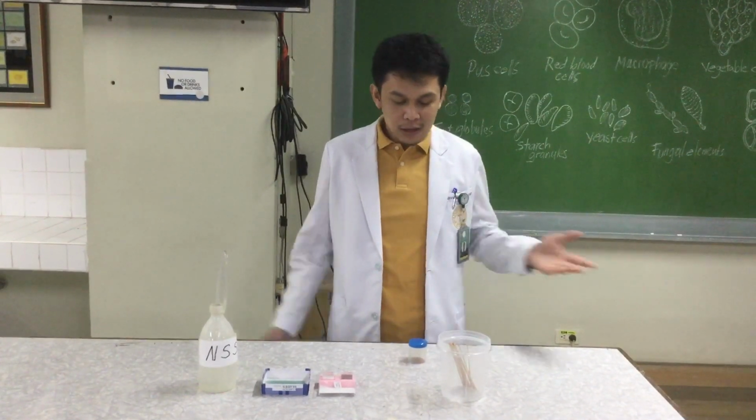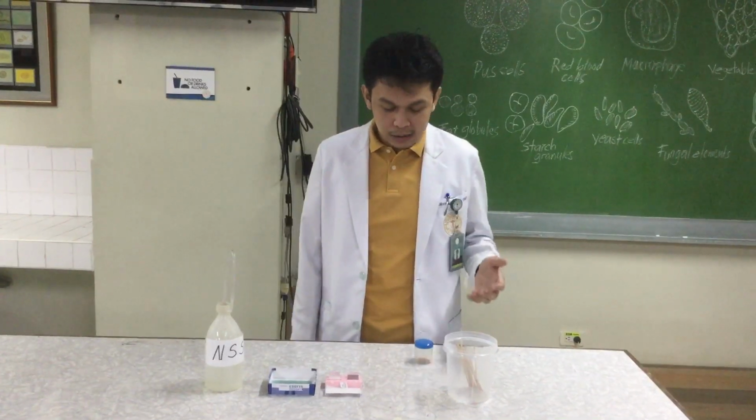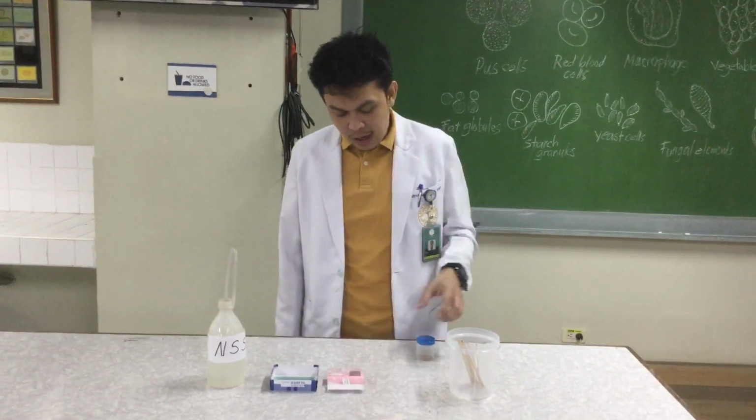More often than not, the specimen that you will receive when it comes to parasitology is always stool, although sometimes it can be blood or biopsy, but more often than not, you will receive stool, just like this one.